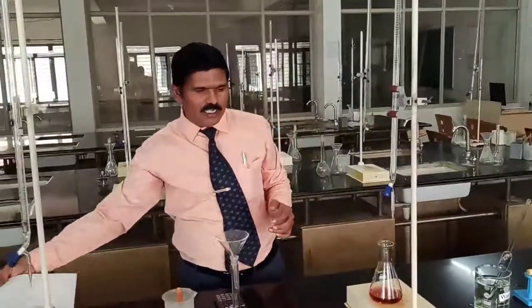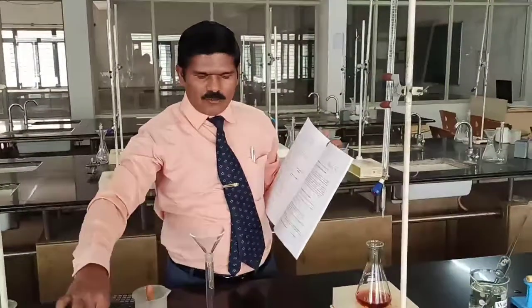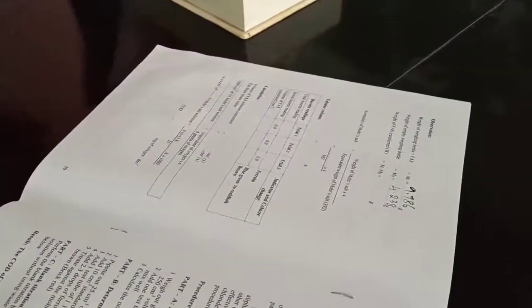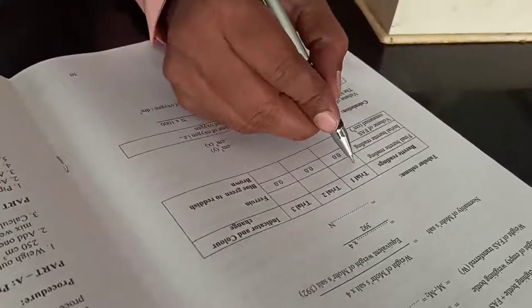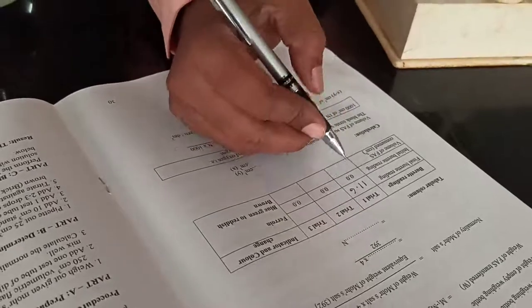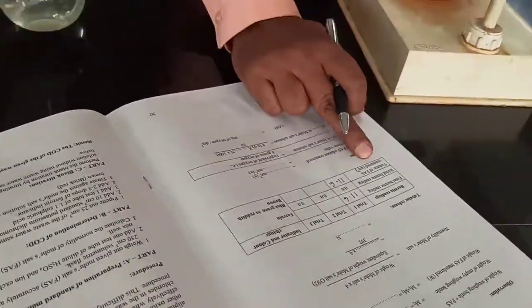Now write down the volume of FAS solution — ferrous ammonium sulfate consumed for the titration — and record it in the tabular column in your manual. The volume of ferrous ammonium sulfate consumed is 11.6 cm³. The initial burette reading was 0, so the volume of FAS solution consumed is 11.6 - 0 = 11.6 cm³.